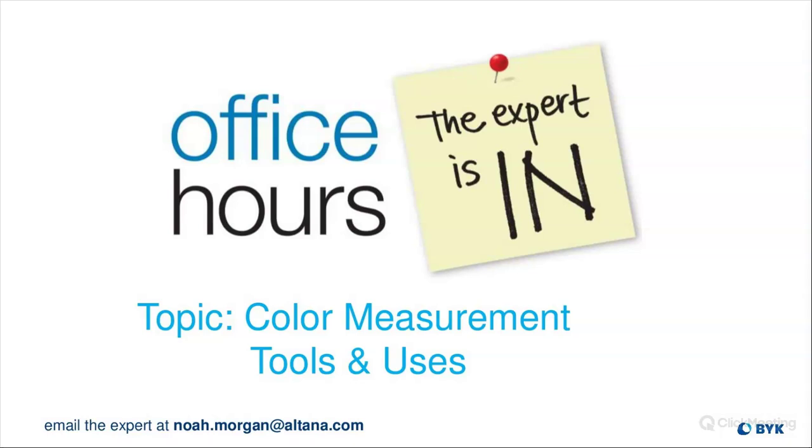And so now, let's say further down the line, if we have multiple batches and samples, we start to have failing ones that are on the high end, or we have passing ones that are on the high end, and another facility has passing ones that are on the low end. When they come together, they may not match up correctly. That's some issues that could happen, and that's where the spectrophotometers really play a role in providing the digital standards.